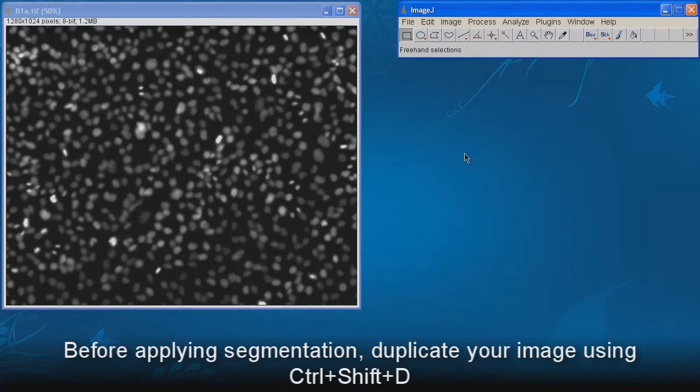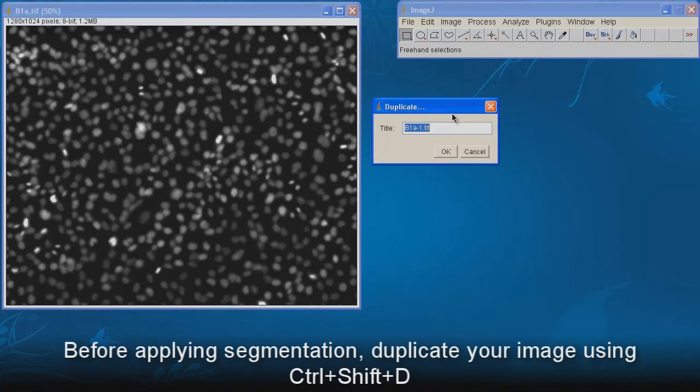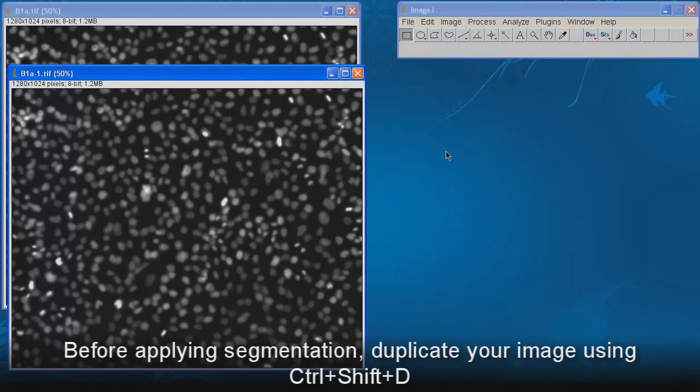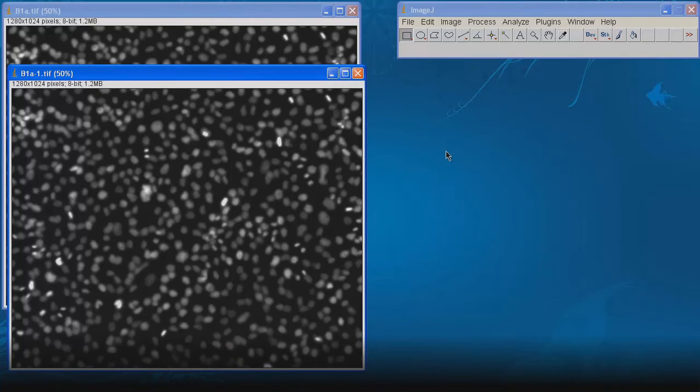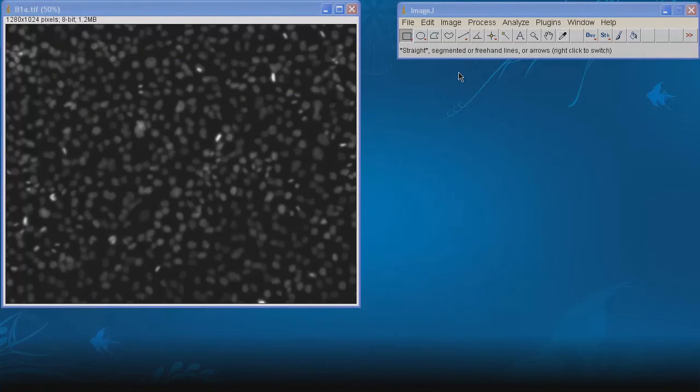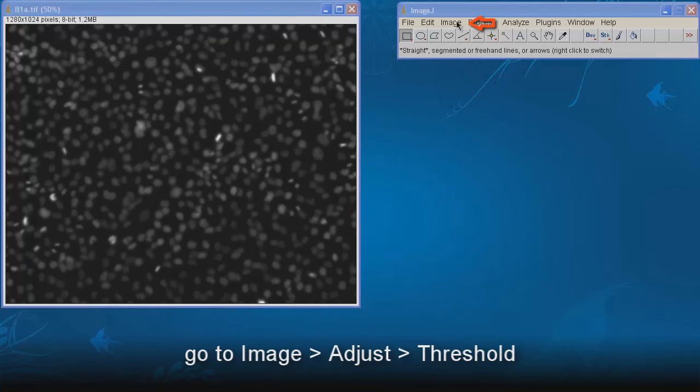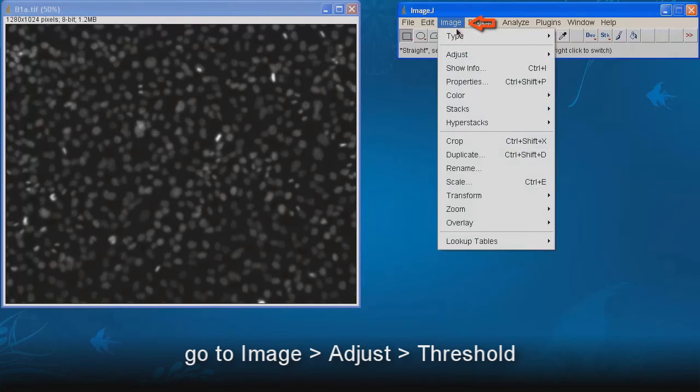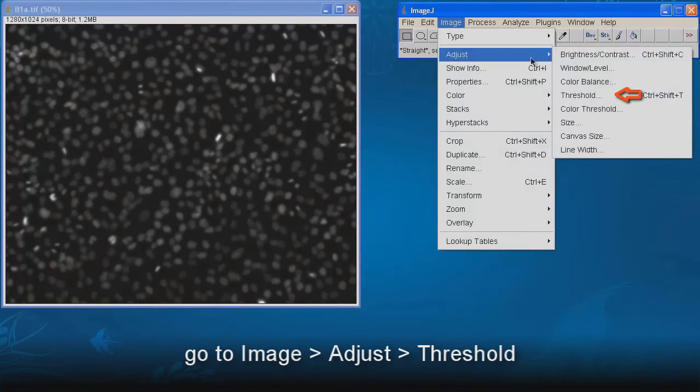Before applying segmentation, duplicate your image using Ctrl Shift D. Go to Image, Adjust, Threshold.